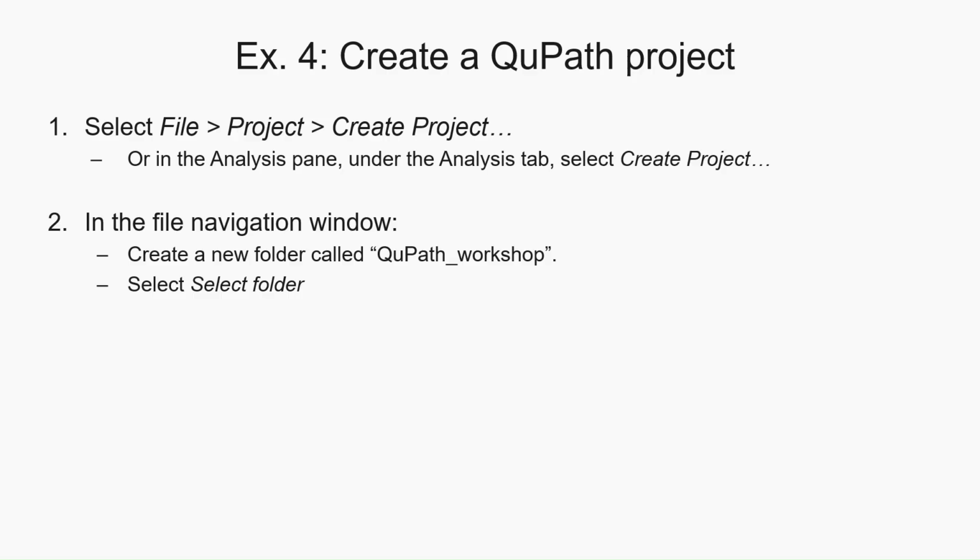We've opened an image in QuPath. When we perform analyses, we want to be able to save that progress for us to open later on. To do this, we need to then create a project which will then save our analyses within.